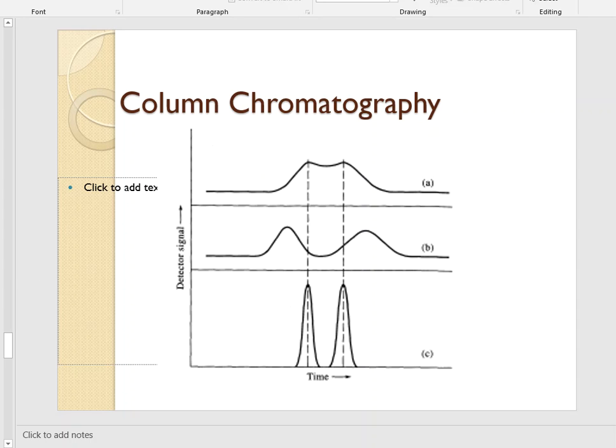By plugging in the values in the resolution equation, we will be able to go through a series of mathematical steps to basically prove that these two peaks are either well resolved or need improvement, and they need separation a little bit more. So that's why we've incorporated the equation. That's why we use the equation, and we just make sure that the peaks are going to be separated before we start processing it with values and numbers.